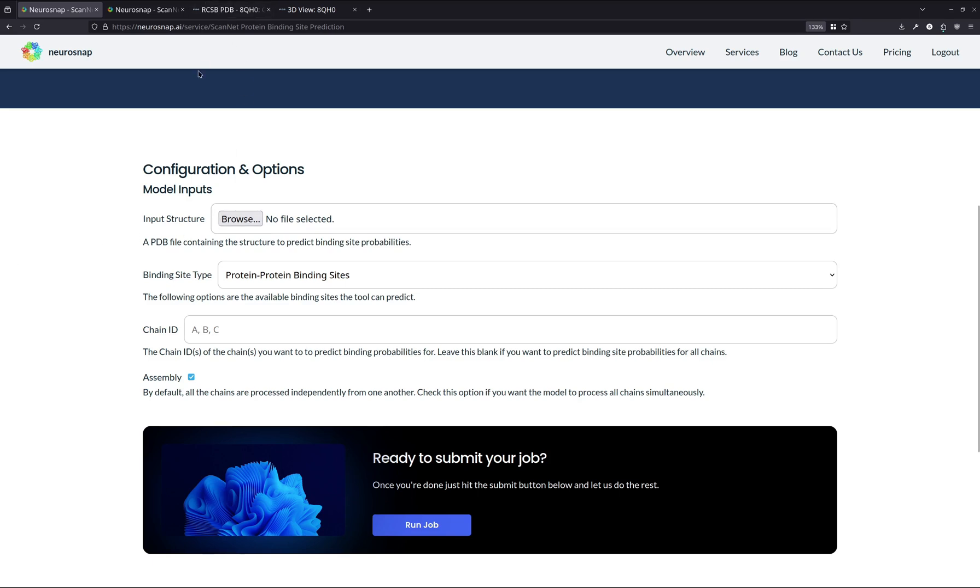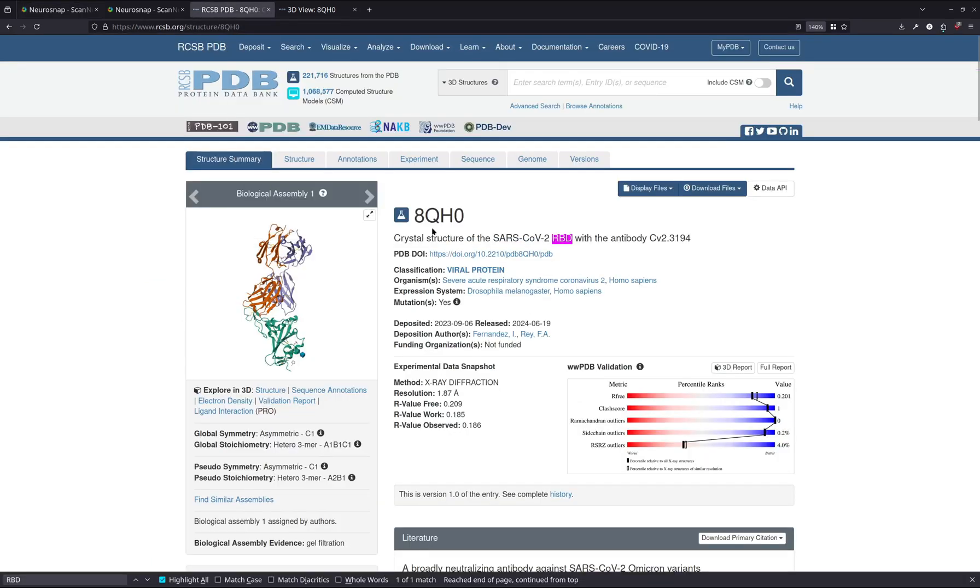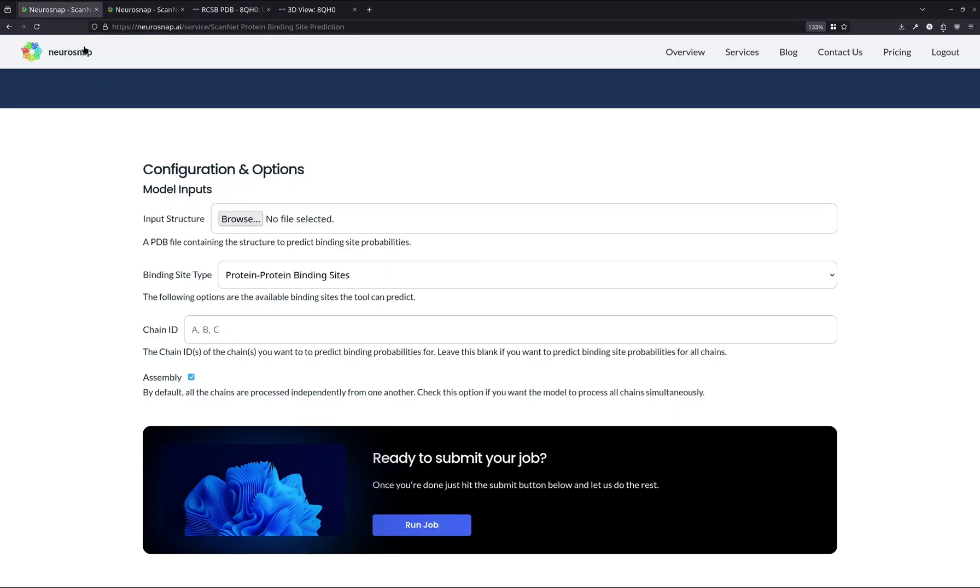For our input structure that we're going to be using in this demonstration, we're going to be using the 8QH0 structure from the PDB, which is essentially the SARS-CoV-2 receptor binding domain bound to an antibody. So these two chains colored in orange and purple are going to be the two chains for the antibody. And this green one over here is going to be the receptor binding domain of the spike protein. Now, what we're going to do is we're just going to select it as the input structure and upload it here.